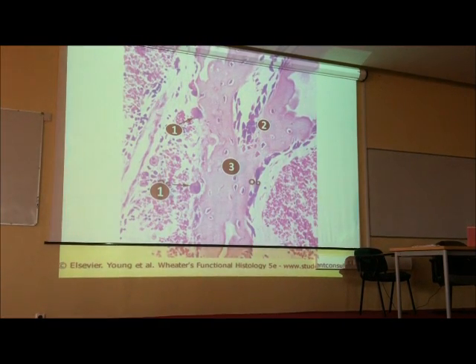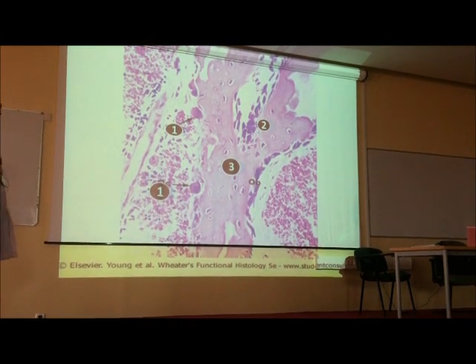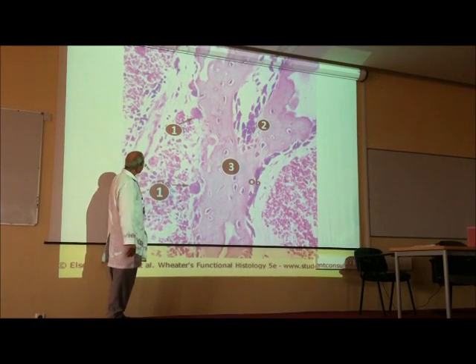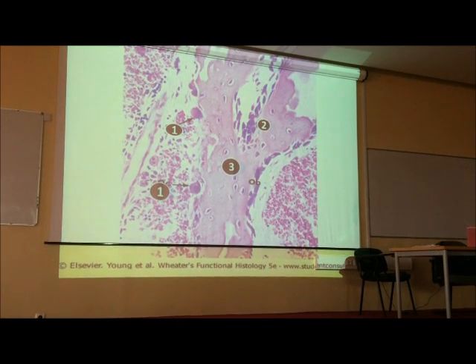This is another nice picture, I think, but the previous one was much better. What is number 1? Osteoclast. Very good. Number 2, I forgot to put an arrow. It's endosteum. Number 3, the bone trabeculae. The areas containing red blood cells, rich in blood cells, are the bone marrow. I think this is an eosinophil. This is an eosinophil leukocyte. Yes. Forget about this eosinophil.